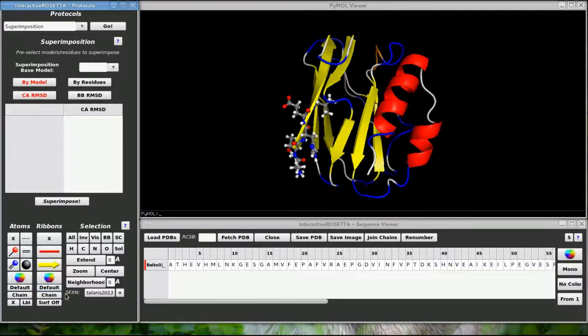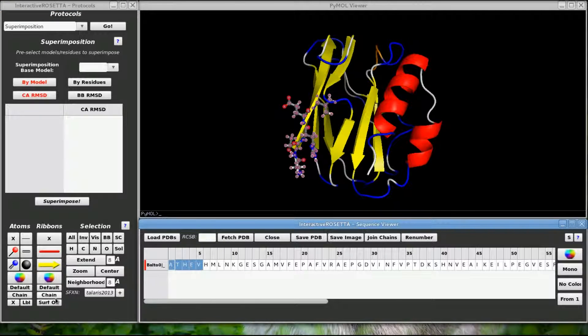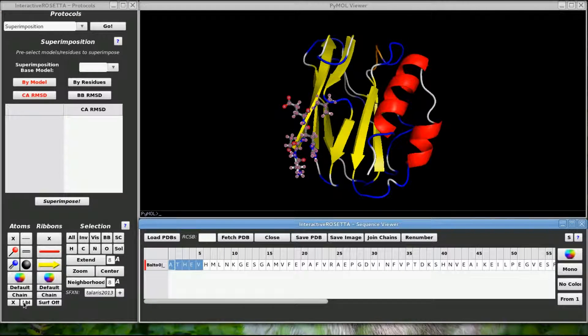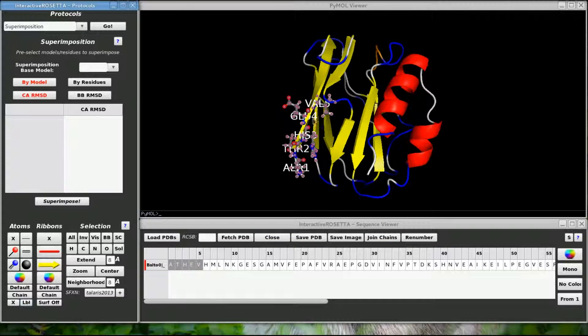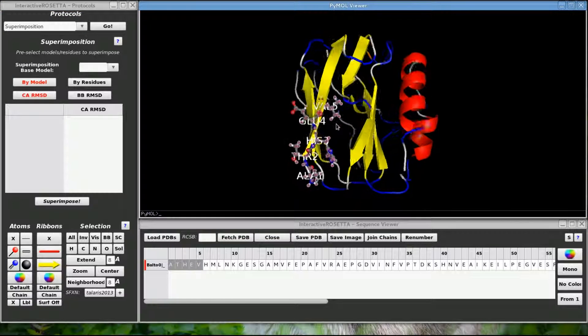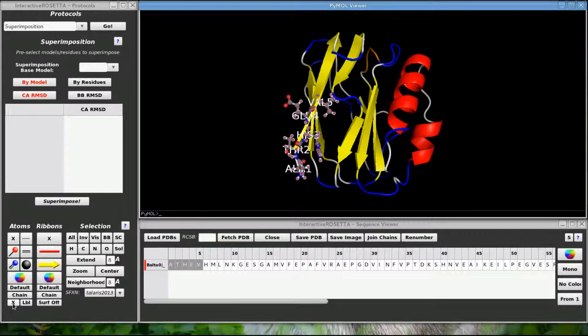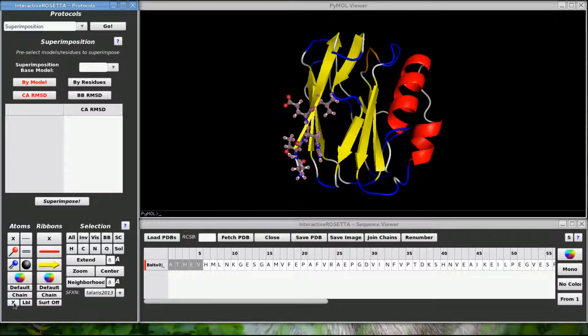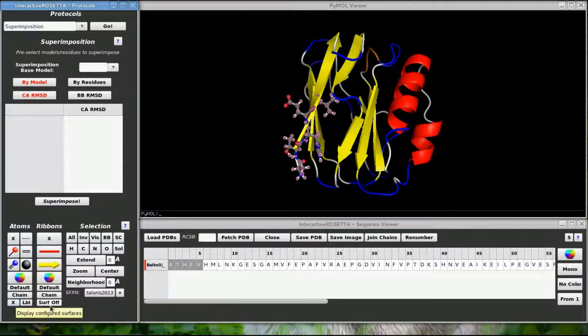These buttons down here will turn labeling on and off. Let's select the first 5 or so residues. Clicking the label button will give me a label telling me the amino acid type in the PDB numbering for these residues. This button removes the labels. The surf off button controls surface displays and I will cover that in a later tutorial.